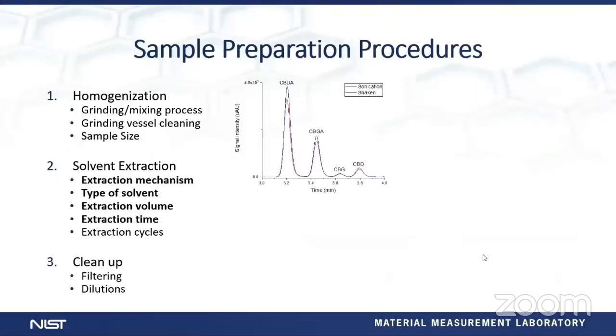Next, focusing on solvent extraction, we compared sonication and shaking, and we really saw no difference between the two, and ultimately chose shaking, as that would be a much more common analytical instrumentation that they would have in a common laboratory.